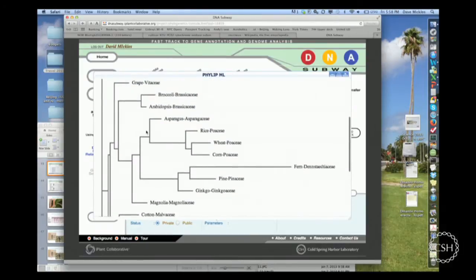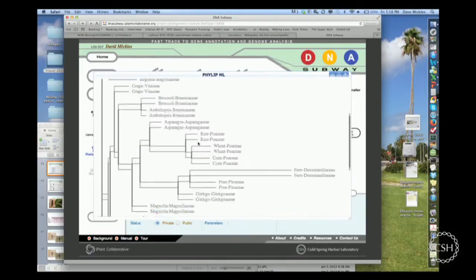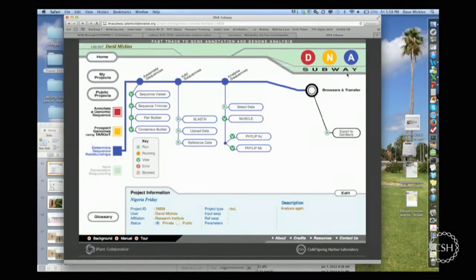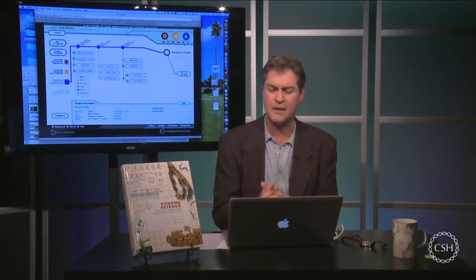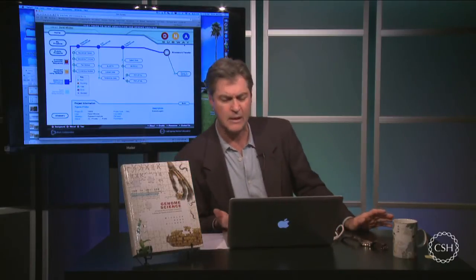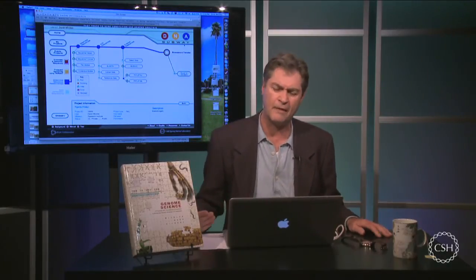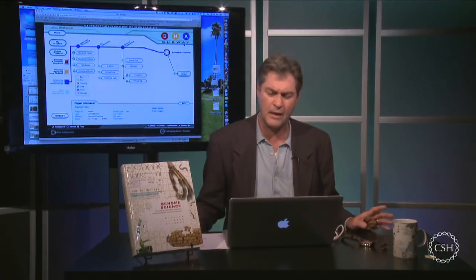Okay, and this can sometimes help you understand the relationships between things. I will warn you to take any tree with a grain of salt. You really have to pick the right set of data. They have to be carefully trimmed. And they can mainly help you to understand where you already have some knowledge. If you just use a tree blindly, I don't think it will help you very much.